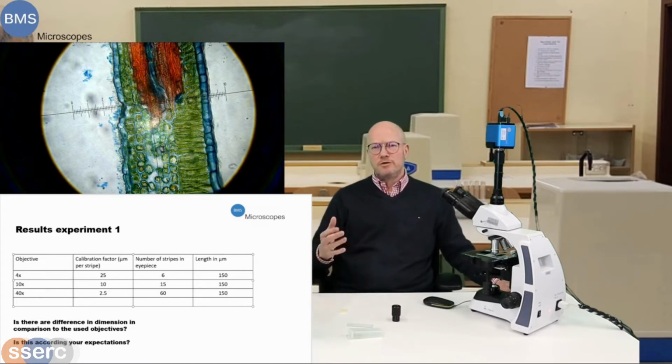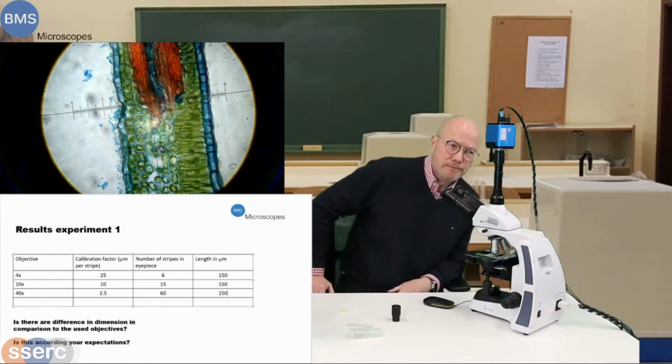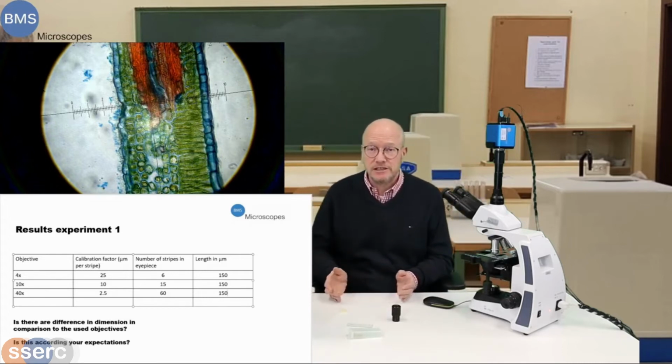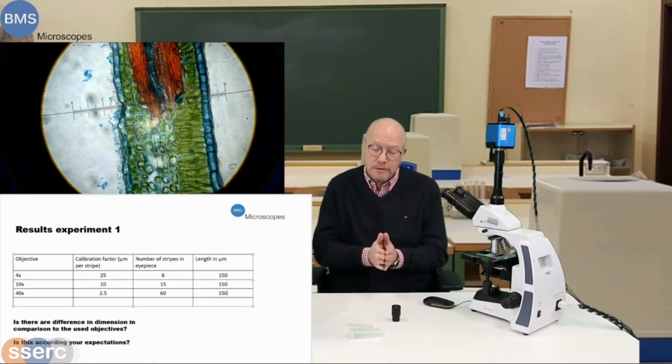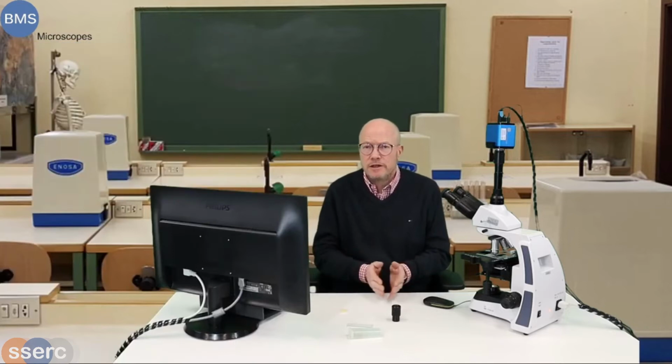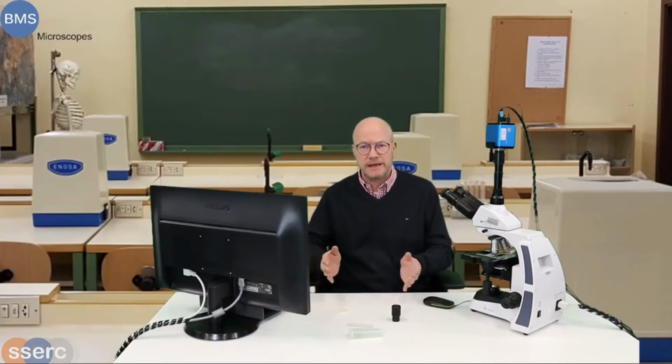Was this to be expected? Because we make measurements at different magnifications. But of course, if you have done a proper calibration, it shouldn't differ. You measure more or less the same place in the slide, so with different magnifications you should get the same results. And that's exactly what we see here.